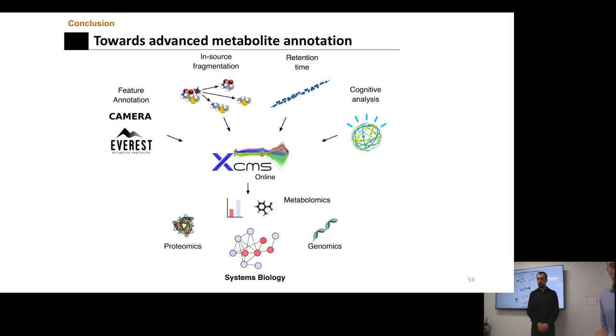I know that there were a couple. About in-source fragmentation, I identified an annotated peak relevant in the PCA as being actually the base peak of a compound, only because I knew about the possibility of this compound occurrence. Is there a way to determine this with confidence using METLIN instead? I'm not sure if I completely understand.